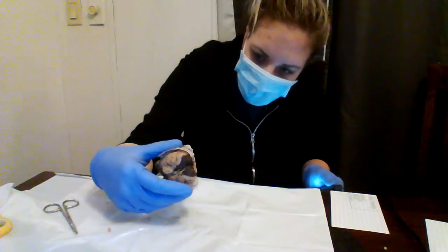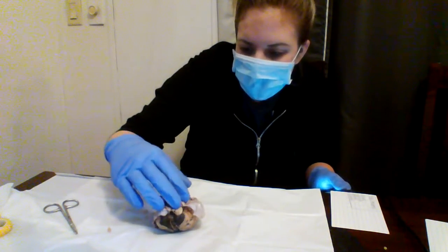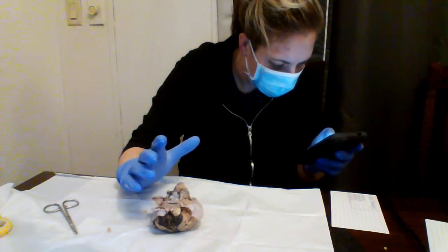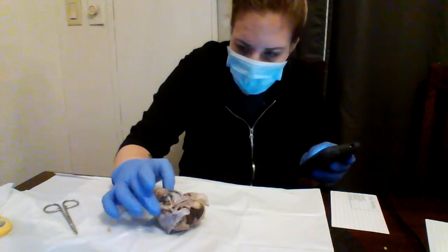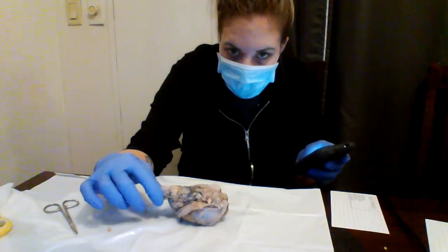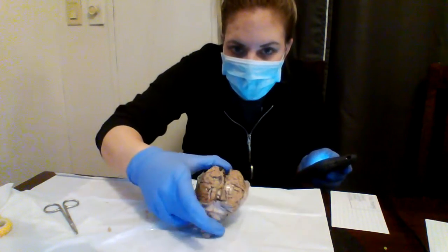If we turn it over this way, you can see all the different pieces of it. I guess this would be like the inside of the brain, not the back or whatever. The optic nerve is located underneath here. The brainstem, like we said, was this. The spinal cord is this piece. The transverse fissure would be up here, this line right here. Can't really see it too good.